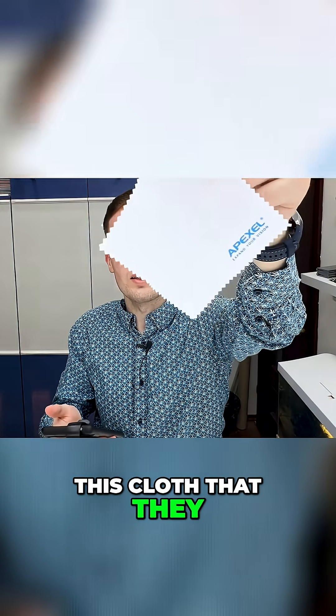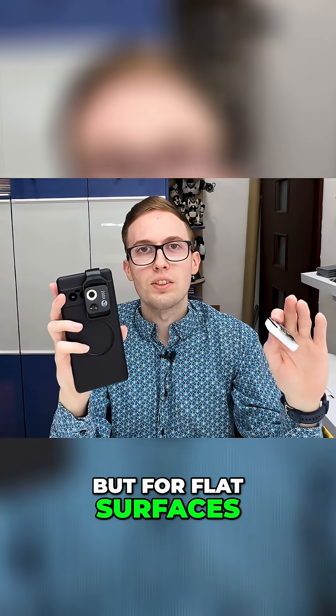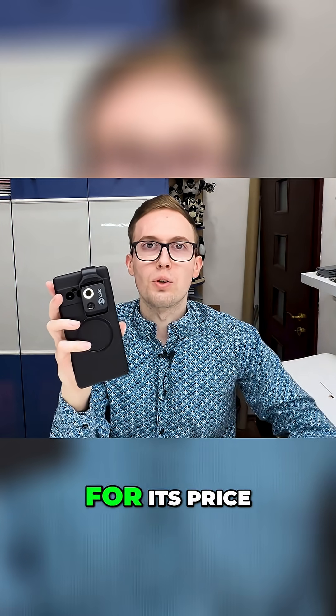For example, this cloth that they gave us in the package. This is really close — the letter R, right here. This is the skin under the microscope. We can even see individual pixels using this microscope. But for flat surfaces, it is really good for its price.